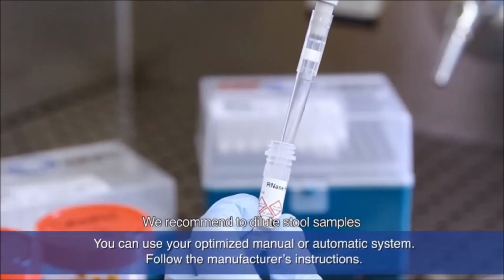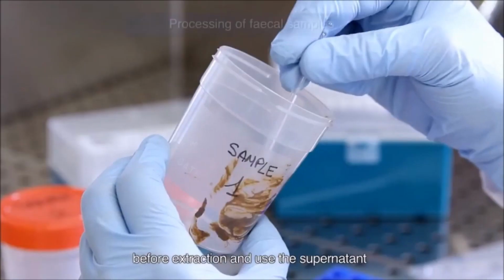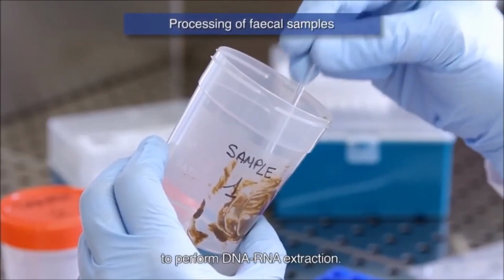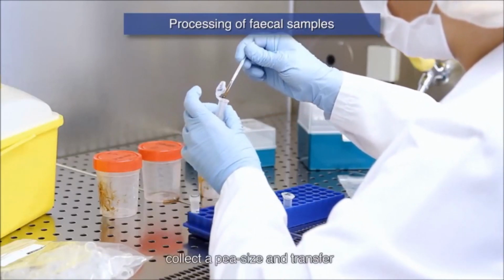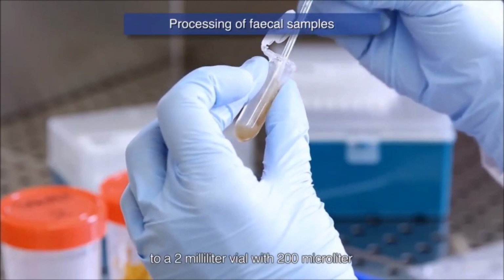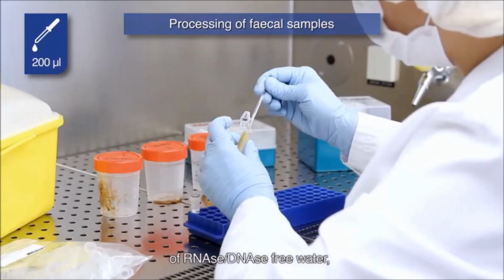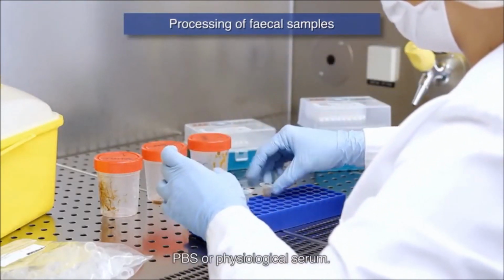We recommend to dilute stool samples before extraction and use the supernatant to perform DNA-RNA extraction. Homogenize the fecal sample, collect a pea-size and transfer to a 2 ml vial with 200 microliter of RNase DNase free water, PBS or physiological serum.